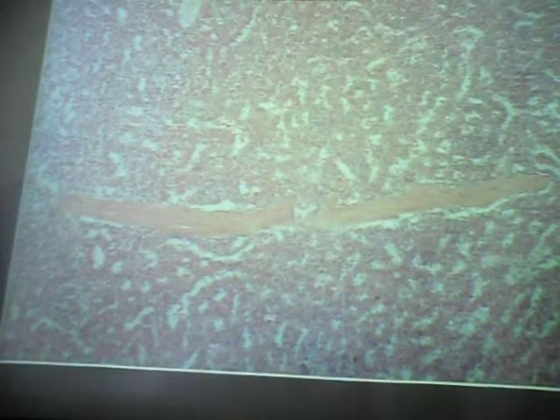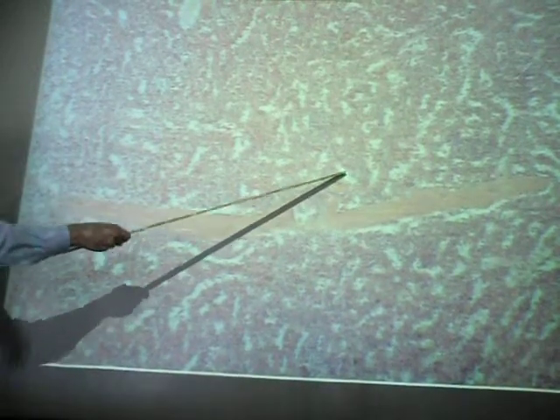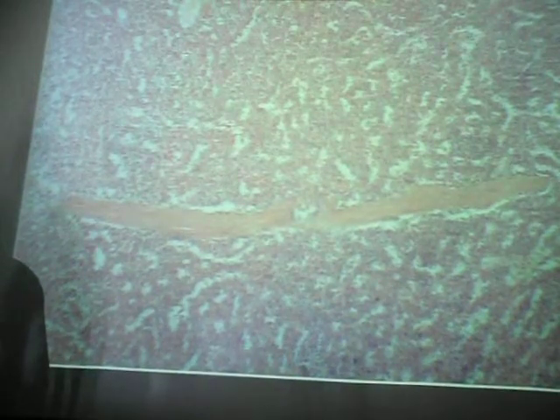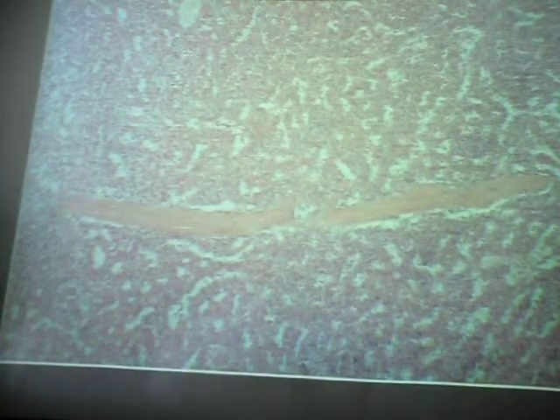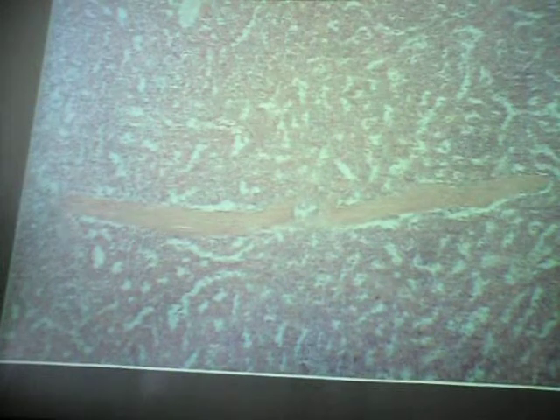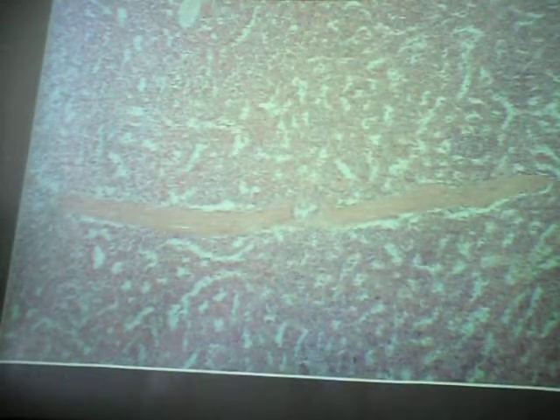Macrophages. What's the spleen doing? It's gobbling up worn-out red blood cells and debris in the fluid passing through in these sinuses. And what is the fluid? It's blood, not lymph. So be aware of what the organ does. The lymph nodes filter the lymph. The spleen filters blood. Okay? Takes debris out. It takes out worn-out red blood cells and also a lot of microorganisms that may be in the blood as well. Okay?